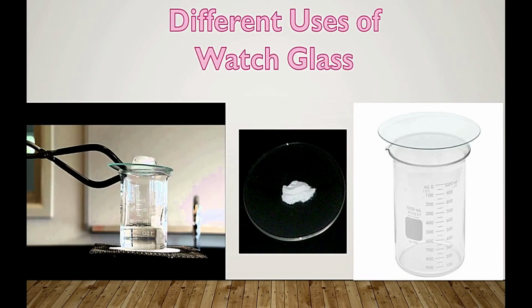These are some uses of watch glass. Over here it is used for covering a beaker, for weighing some solid, or for watching crystallization or precipitation or evaporation process.